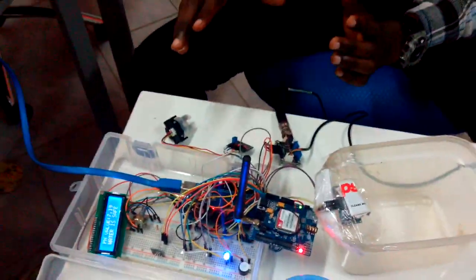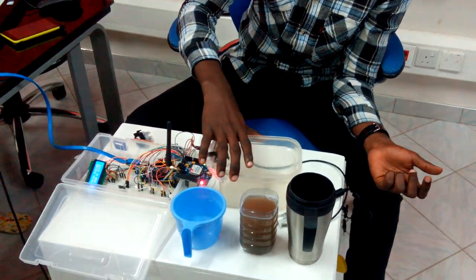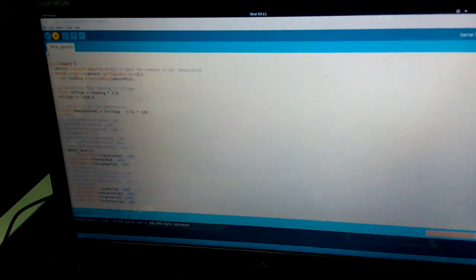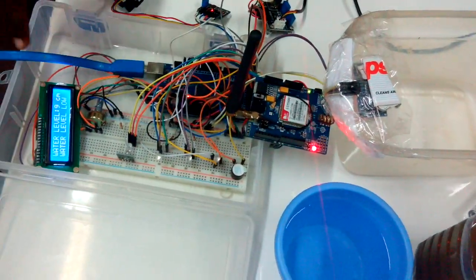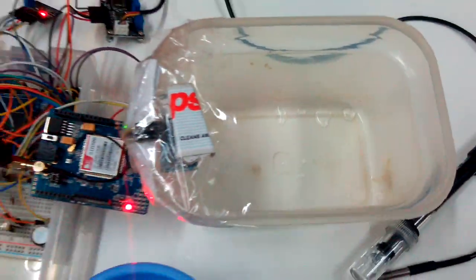Right now we are going to demonstrate the water level. There is no water in this tank. After uploading the code, we can see from the LCD display that since there is no water in our tank, there is a buzzer alert indicating the water is very low. It says the level is 9cm and the water level is low, meaning there is no water in the tank, so it gives you an alert.